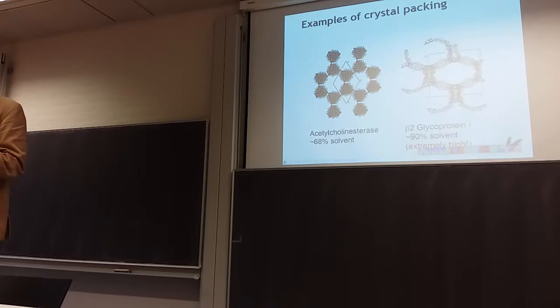You had a question or a suggestion? Suggestion. There's certain balance between what's kind of solved, etc. Together. Okay, so the conditions, right? So, yeah, this is one of the magic ingredients in crystallization. Salt concentration, different kinds of co-solvents, the pH, temperature. There's kits you can buy that actually help you screen thousands of different conditions to find the exact right one that will get your protein to crystallize. So that's one part of it.